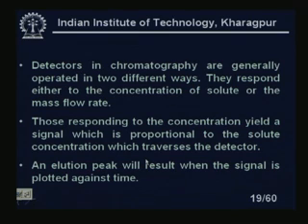So, an elution peak that I just drew. The peak that we have drawn is called the elution peak, right. So, this is the peak which we have talked about. This peak is called the elution peak because it will come out of the column and suddenly you will detect it at the output.